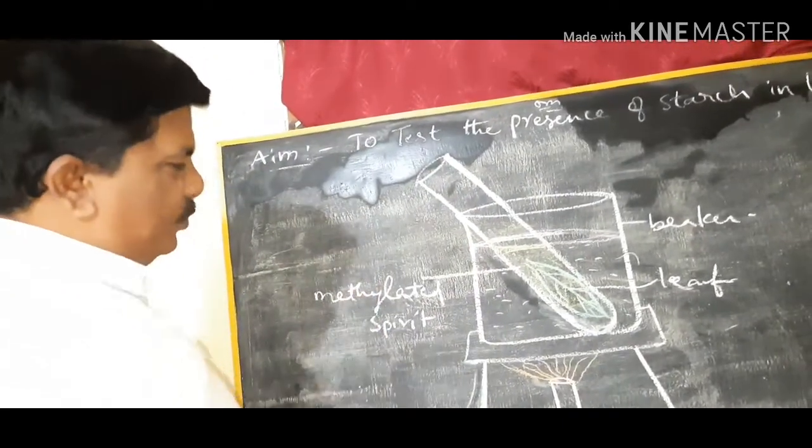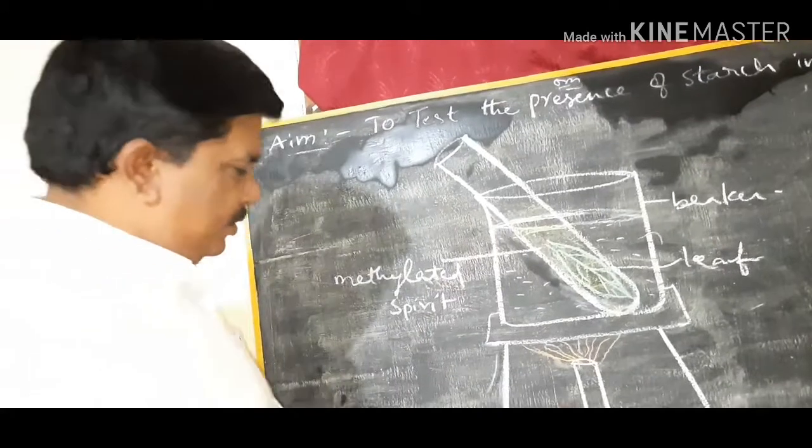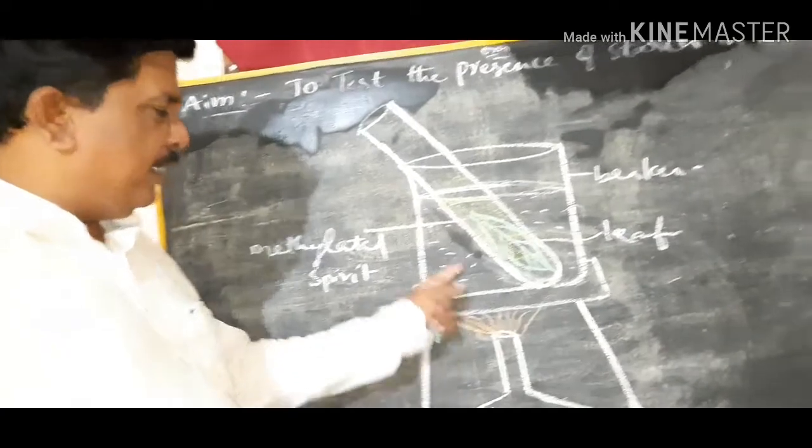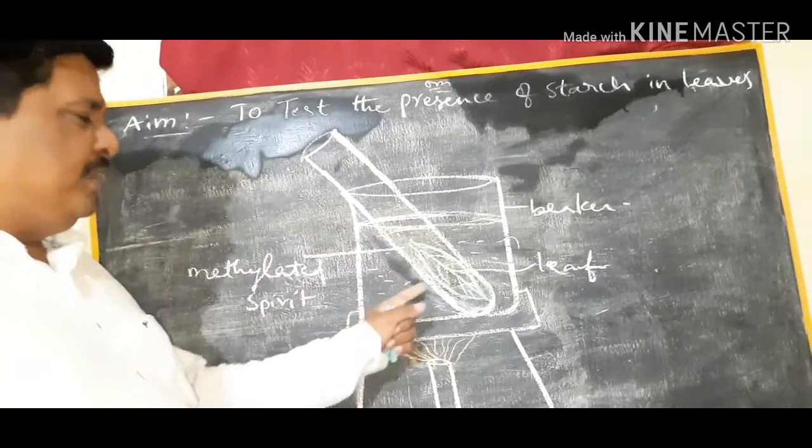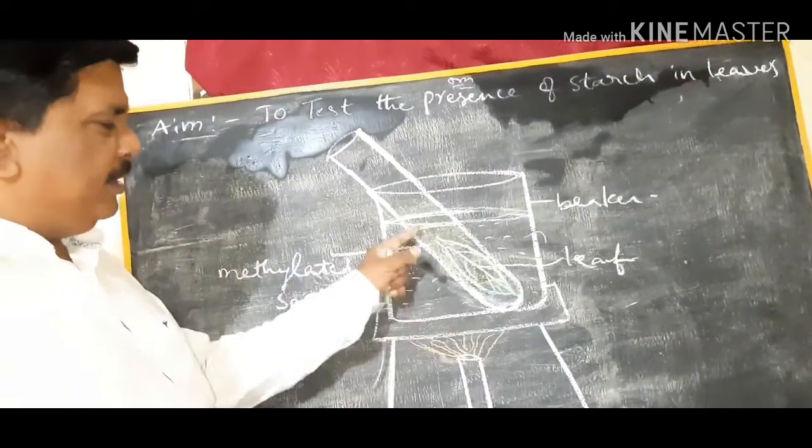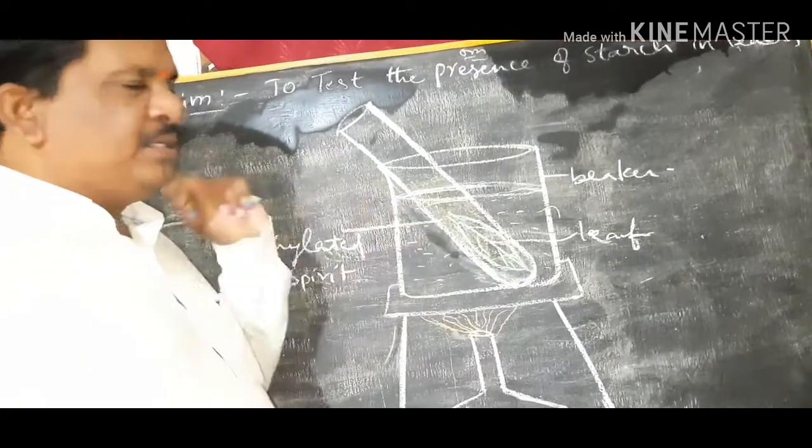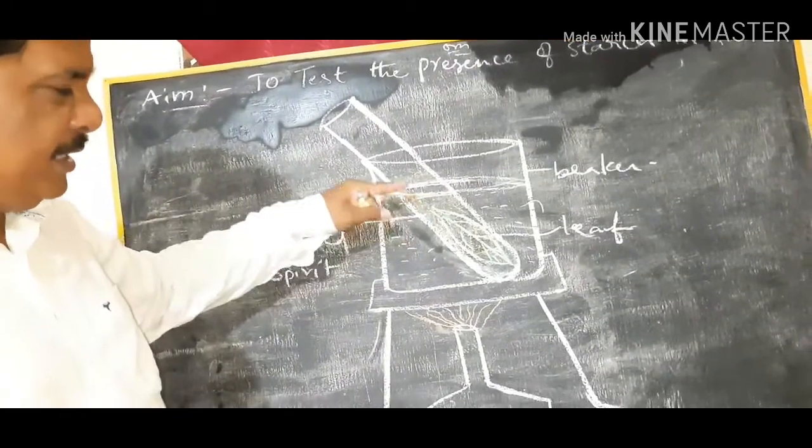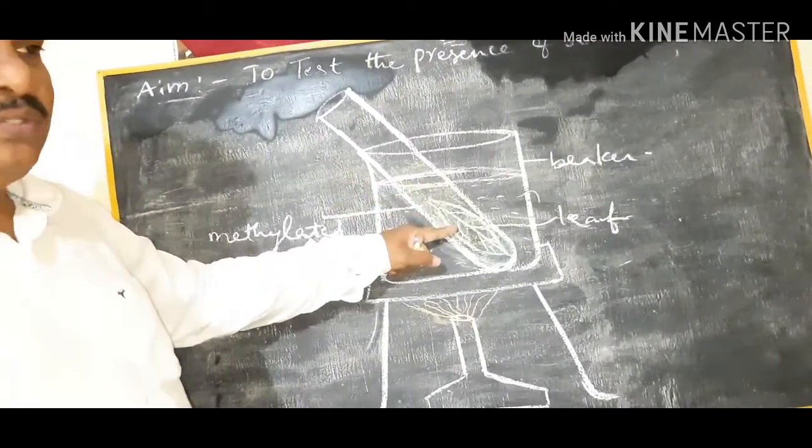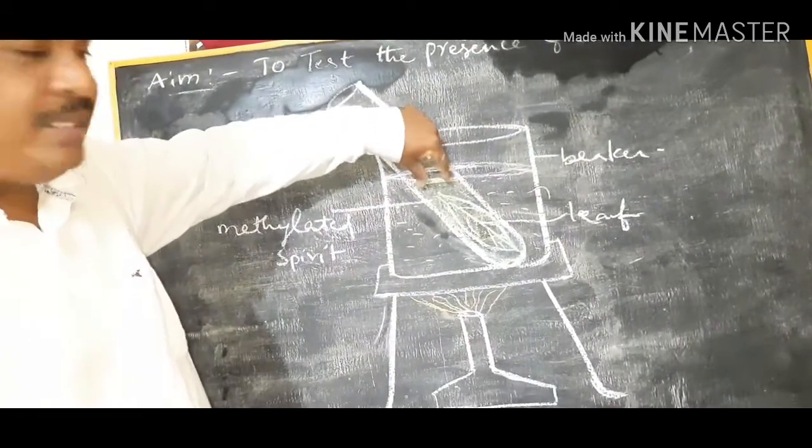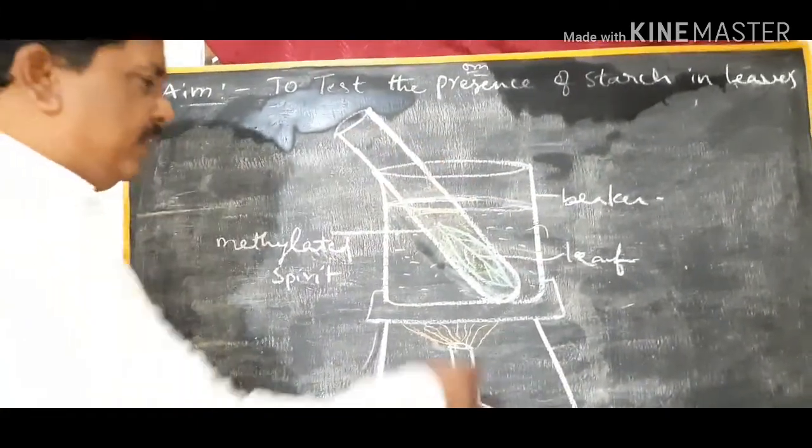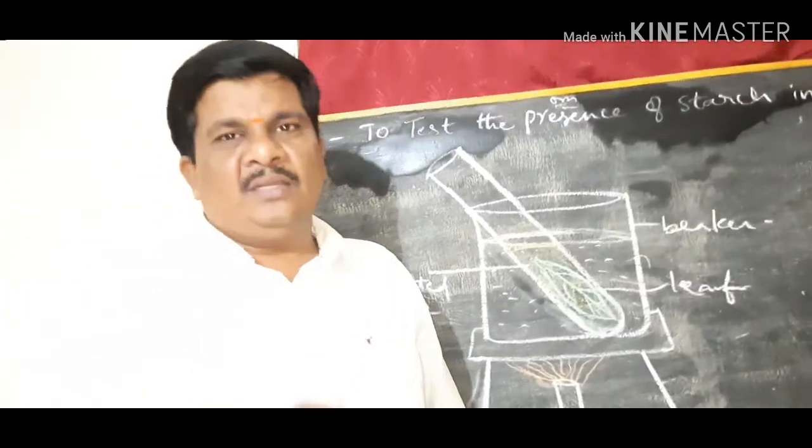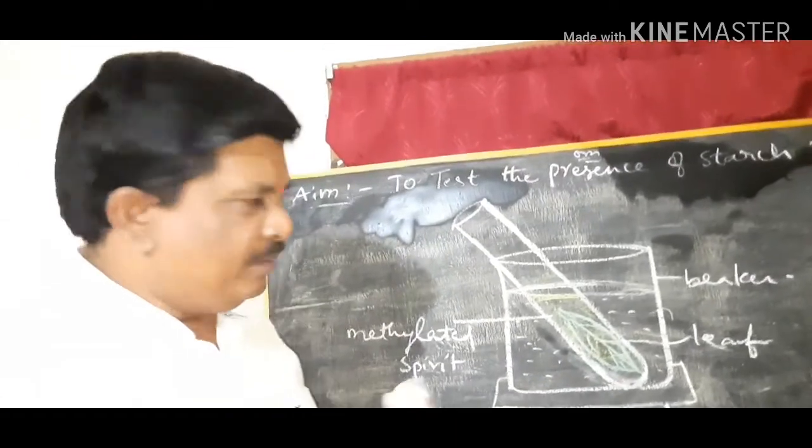Now keep this test tube in the beaker which contains water. We have to boil this water using a Bunsen burner. When water gets heated, then immediately the test tube gets heated. When the test tube gets heated, the alcohol or spirit present in the test tube also gets heated. When the methylated spirit is heated, the leaf loses color. The methylated spirit or alcohol bleaches the color of the leaf, and it turns pale.